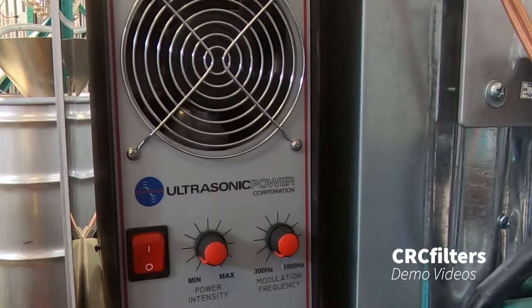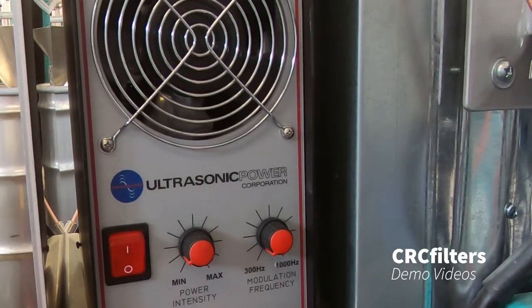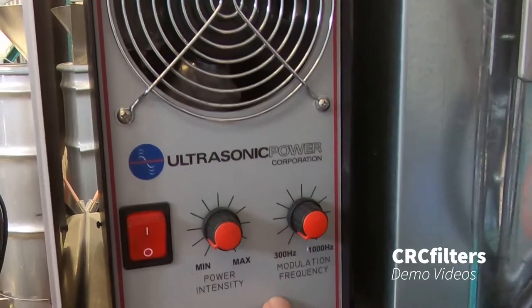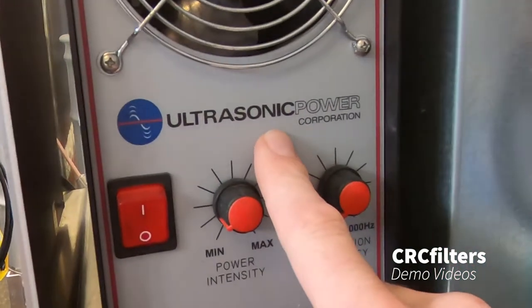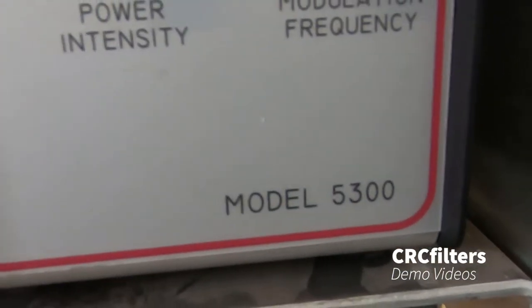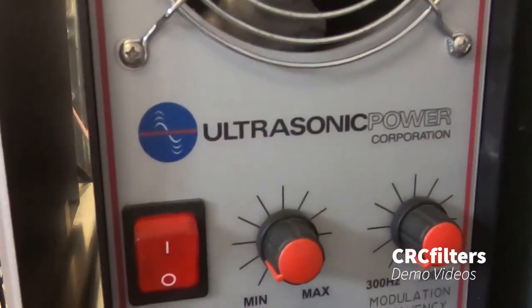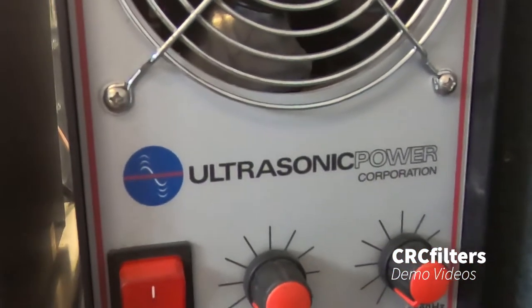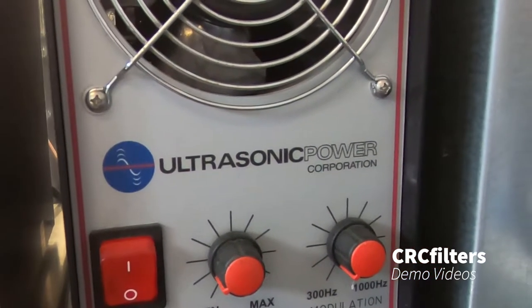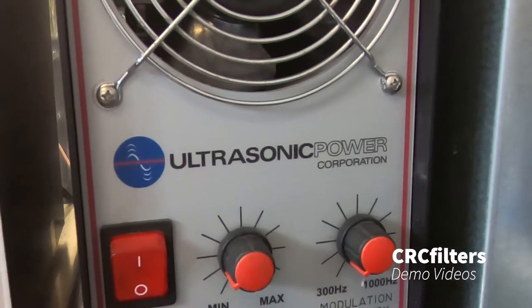The last thing I want to look at is the ultrasonic generator. This does not come with the system — it's something you'll have to buy separately. I would recommend the Ultrasonic Power Corporation, and this is the model 5300. This is a 1000-watt unit. That's why we've got two wires — each column is 500 watts and they're run separately. Let's take a look at the back of the generator.